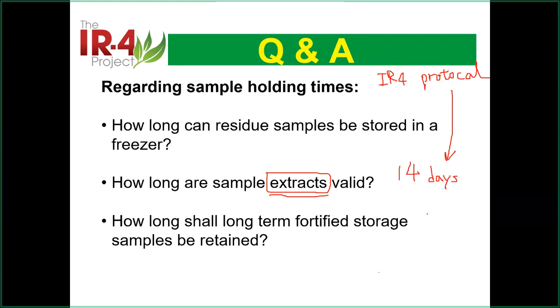But whichever is more restrictive, if you follow IR4 protocol, or most likely in this case you will, because it's the same template, the same format. So you need to use 14 days. For all your extracts, you extract your samples. After 14 days, get rid of them. Start a new extraction. Okay.